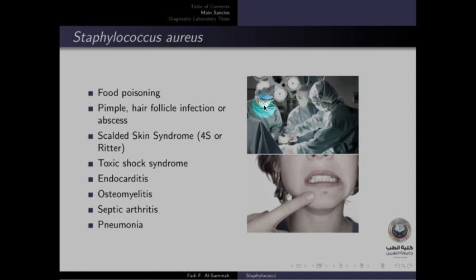They are wearing the face mask. Well, one of the reasons is to try to avoid the transmission of Staphylococci from persons who are known to be nasal carriers. What is known so far is that about 20 to 50% of people are nasal carriers of the Staphylococci.